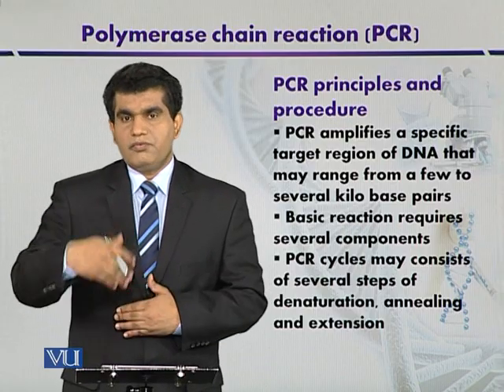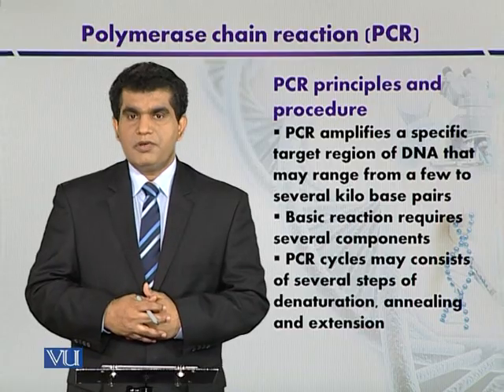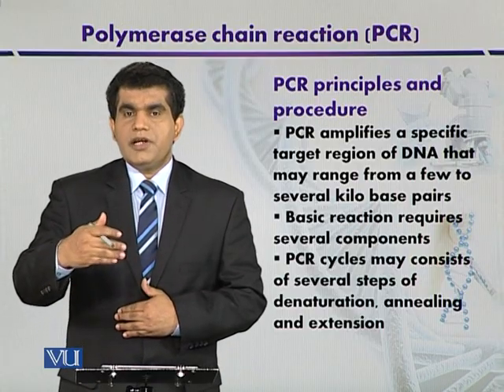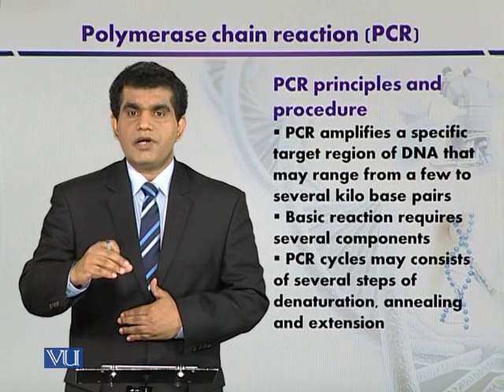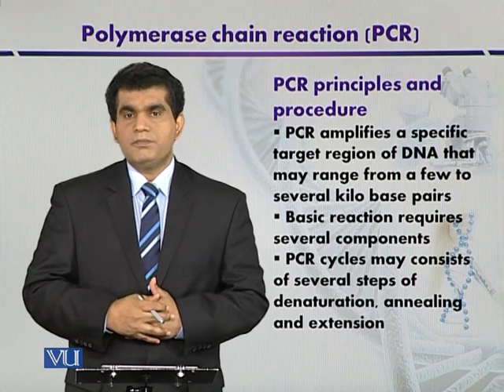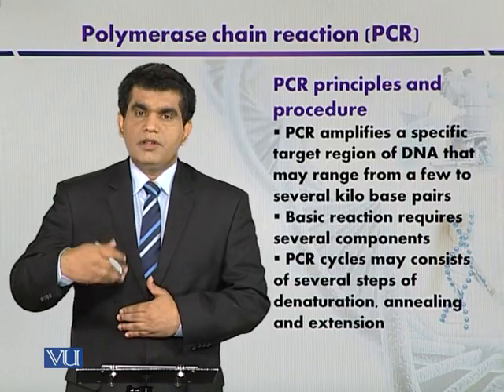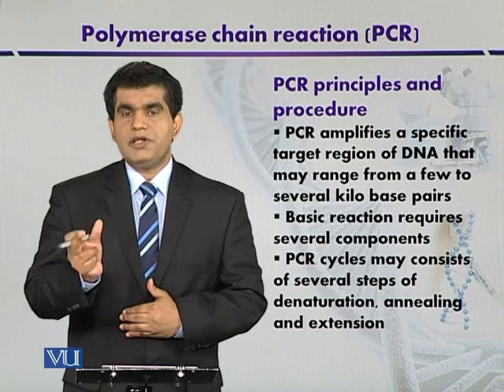Now we can briefly focus that what may be different reagents that we can use during the process of DNA amplification. जैसे मैंने लास्ट टॉपिक में भी एक्सप्लेन किया कि जो बेसिक रिक्वायरमेंट है उनमें से डीएनए टेम्पलेट है कि हमें एक टारगेट डीएनए की ज़रूरत होती है जिसको हम एम्पलीफाई करना चाहते हैं, और इसमें जो टेम्पलेट की कॉन्सेंट्रेशन है अगेन इट मे बी वेरिएबल, like it may be 0.1 to 1 microgram, and that can be used in the reaction mixture.